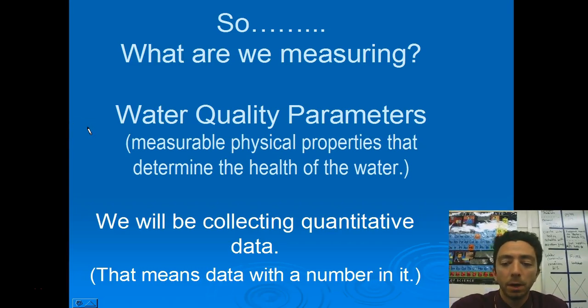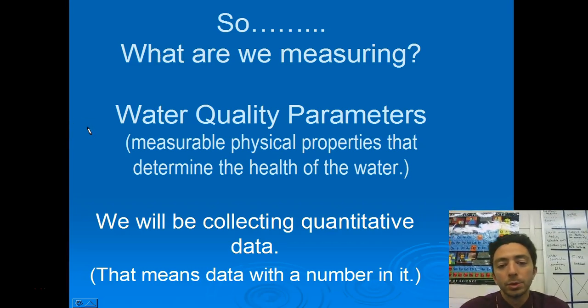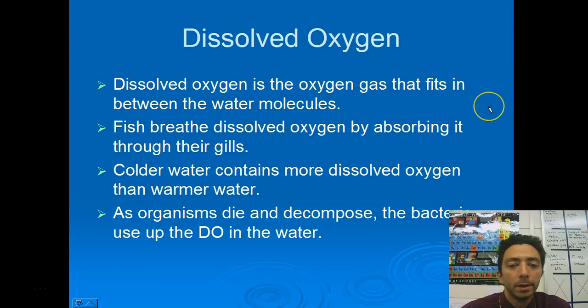This is a video on water quality and restoring freshwater ecosystems. We're going to measure a lot of water quality parameters, and I thought making a video would be useful to go over how we go about measuring these things. They're all quantitative, so we're going to get a number for each of them.